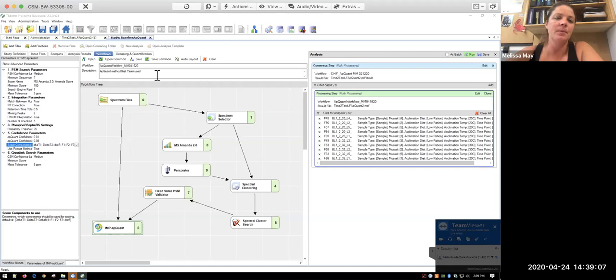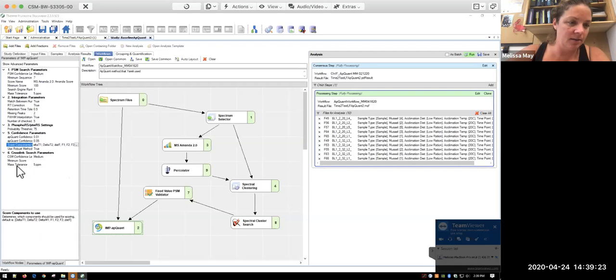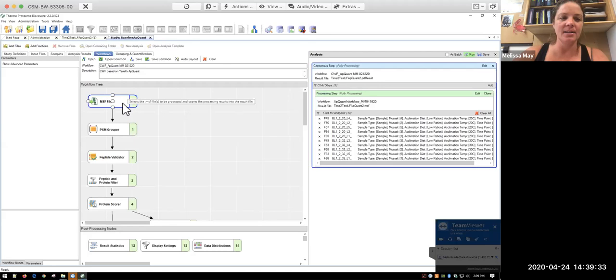So those are the specific parameters for this processing step. And most of the ones that we changed that I pointed out are things that need to get described when you are writing this up for publication. And you can see, I forget where it went, but on one of these it said to make sure that you cite these papers if you're using their nodes. So don't forget to do that.